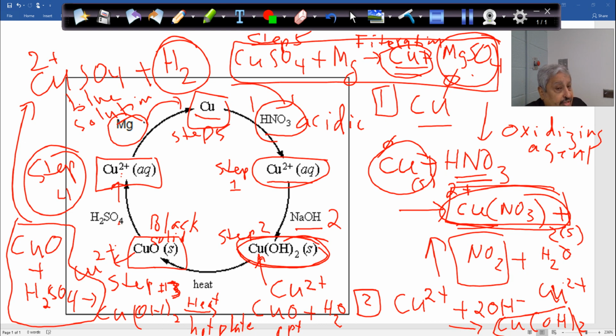You will take this one here with the watch glass to the oven there. I will turn it on. There is an oven in the back. I will turn it on for you. After turning it on, I will keep it just to mild temperature, because if we put higher temperature in the oven, what will happen is you will burn the filter paper. So that your mass of the filter paper will be charred or barbecued. So if you barbecue that filter paper, then the mass of the filter paper is not correct.